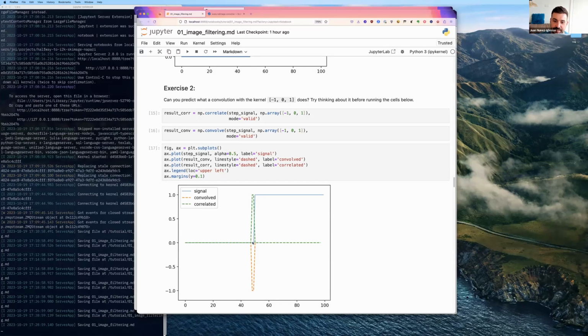and that becomes 1. Now you'll notice that convolve is backwards, and that's because for technical signal processing reasons that I'm not going to cover, because they're kind of confusing, convolve actually reverses the kernel compared to your signal. So yeah, what we're going to use from now on is correlate. And if you look at convolutional neural networks, they all actually do correlation instead of convolution.